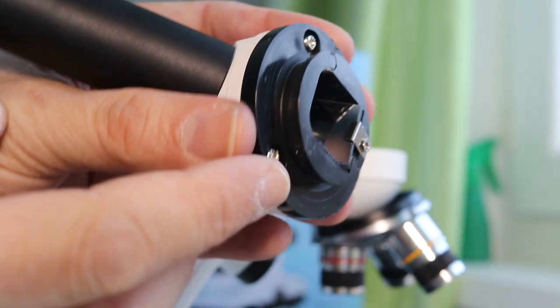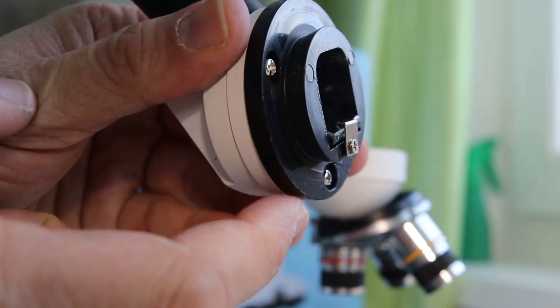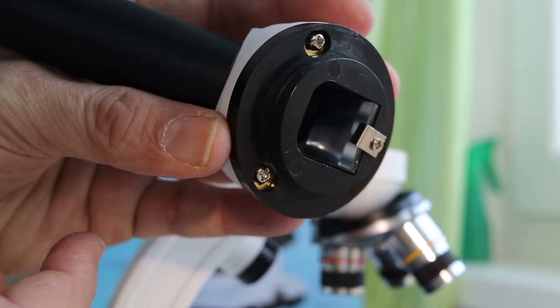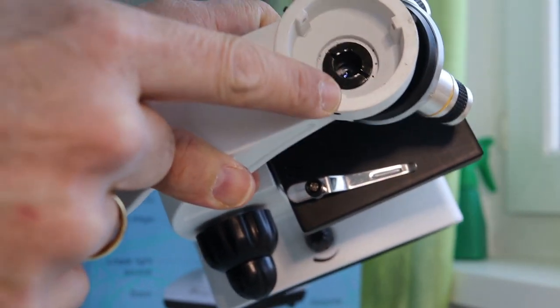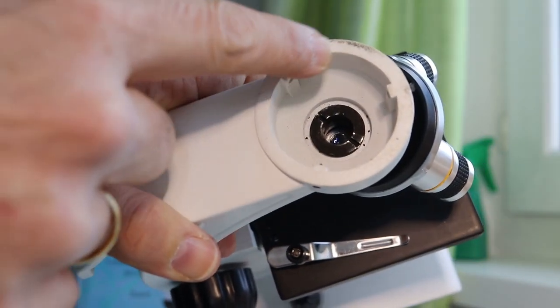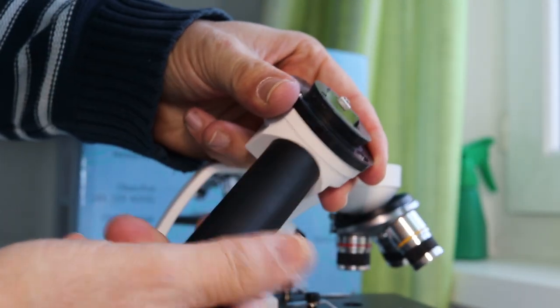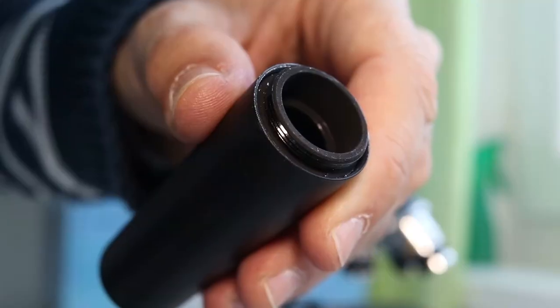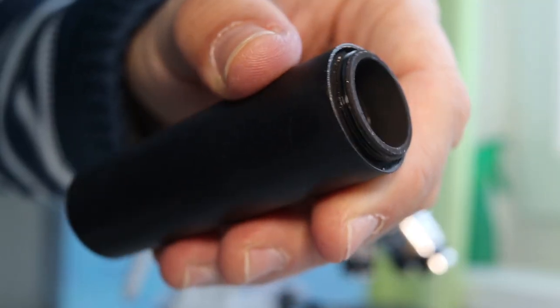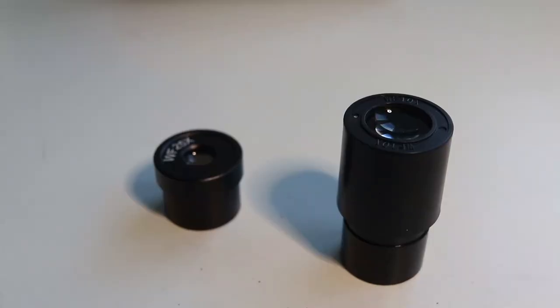This is something that you normally do not see on higher end microscopes. The dovetail is made of plastic, that is one thing, but the rest here is all metal, and it fits in there snugly and firmly. I'm also now disconnecting the tube. This one is also made of metal, as you can see from the threading here, so it is also quite solidly built. And these are the two eyepieces.